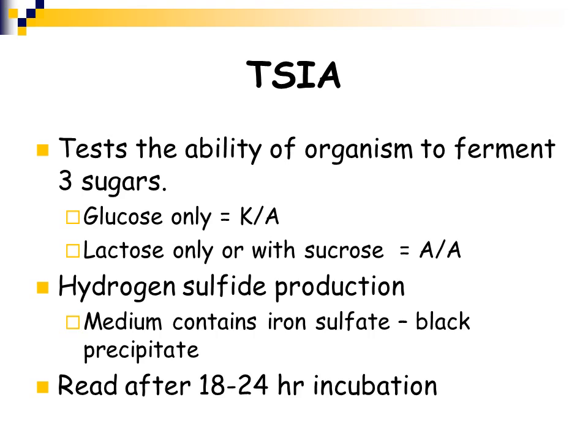What this test does is test the ability of your organism to ferment three different sugars: glucose, lactose, and sucrose. It also detects the production of hydrogen sulfide, and it also tests the ability of the organism to produce gas. Some organisms, when they ferment carbohydrates, generate gas.